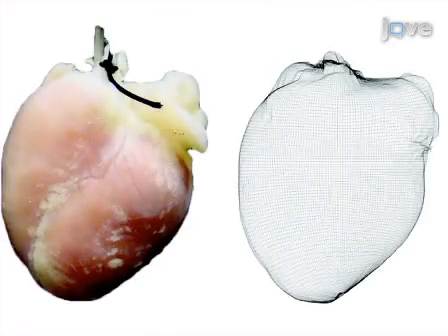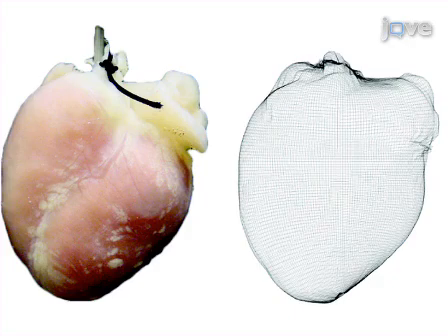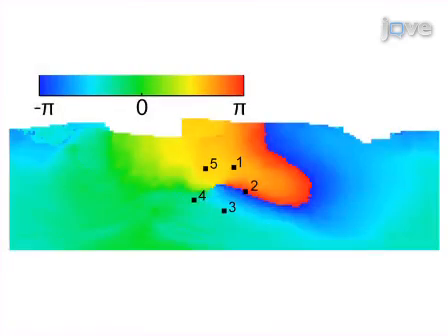The panoramic optical mapping system was used to show this anterior view of a Langendorff-perfused rabbit heart. By comparison, a reconstruction of the heart geometry shows the same anterior view. The unwrapped epicardial surface shown here is color-coded by phase. The heart was undergoing an episode of tachyarrhythmia.